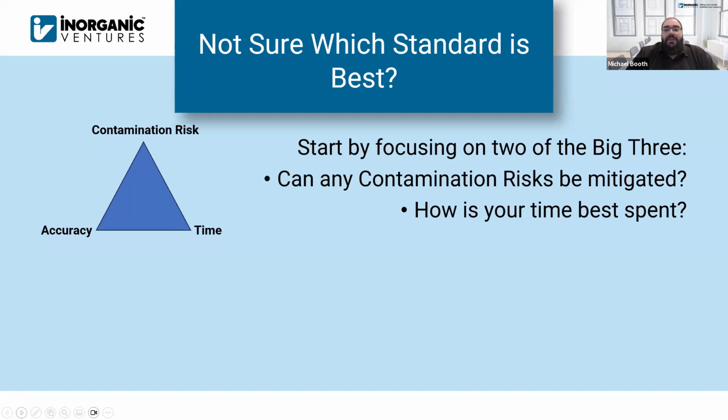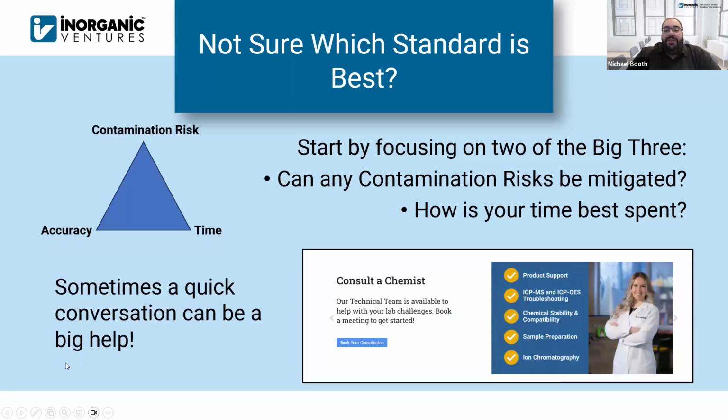So accuracy, you always want to keep in mind, essentially try to be as accurate as possible, but at the same time, understand what is fit for your purpose in terms of accuracy. And if you ever have a question, we're always open for a conversation. Sergey put his contact info on the slide previously in his presentation, so you'll have that contact information. And if you want to ask us a question anytime, just visit our website.